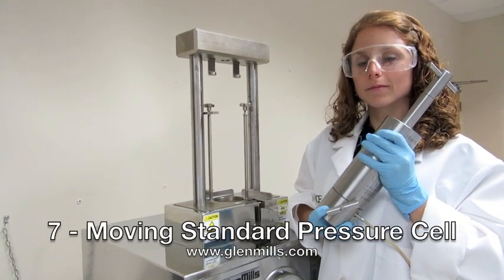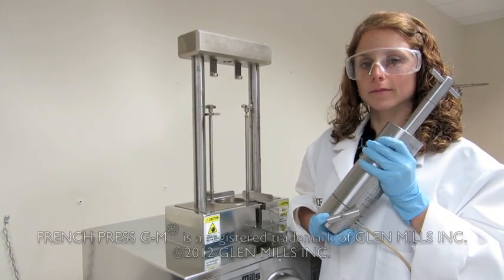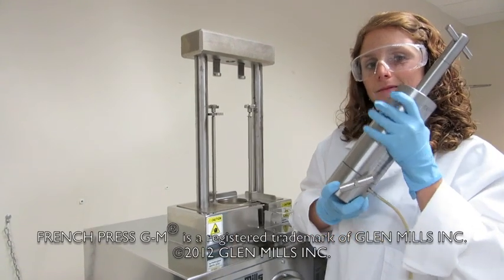Moving the standard pressure cell into the French Press GM. Note, it is heavy, about 20 pounds or 9 kilograms.